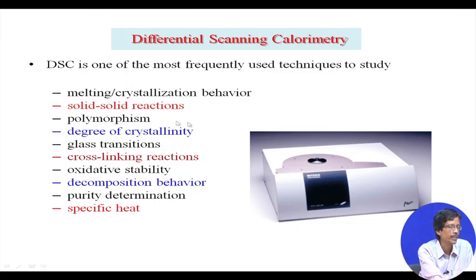So, the most interesting thing is the solid state analysis. So, solid state material, any powder to polymer to rubber, can be analyzed very easily, and we can study those things for their melting and crystallization behavior. So, this melting and crystallization behavior is very important, because we can see the corresponding melting is a transition process where solid is going to the liquid or the molten state.